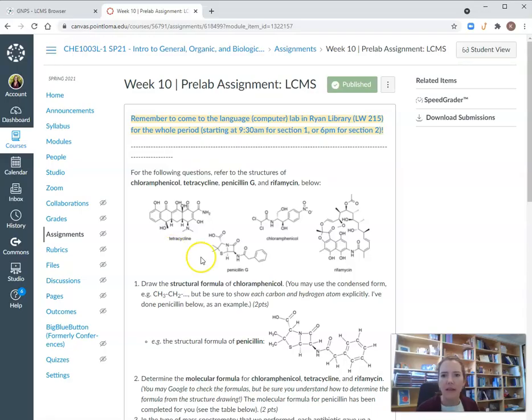And so in this video, I'm just going to show you an activity that I used with students in my introductory general organic and biological chemistry course, commonly referred to as GOB. And in particular in the lab course, I used the dashboard to explore some LC-MS-MS data of natural product antibiotics.